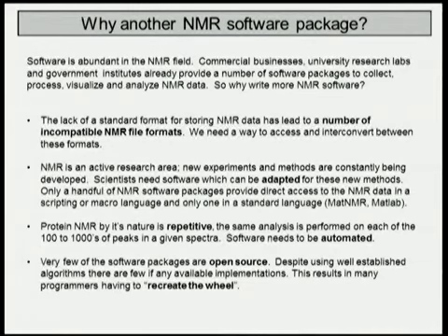In addition, NMR is an active research field. There are constantly new experiments and new methods being proposed in the literature. So we need software that can deal with these new experiments. Really, we need some kind of software that gives us a scripting or a macro language. And there are very few of those out right now, and only one that uses a standard programming language.